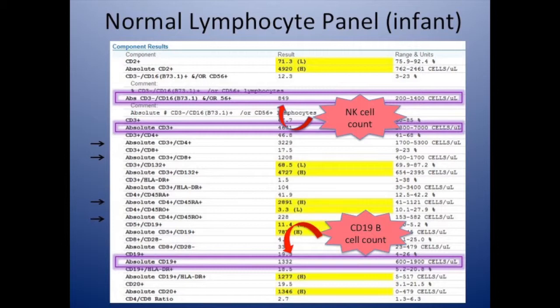Next you'll want to focus on the CD19 or CD20 positive B cell population. And then finally, the CD3-negative, CD16 and CD56-positive cells are your natural killer cells.